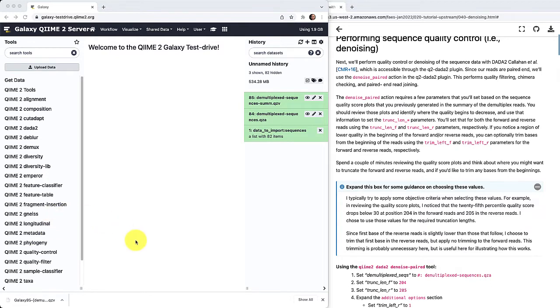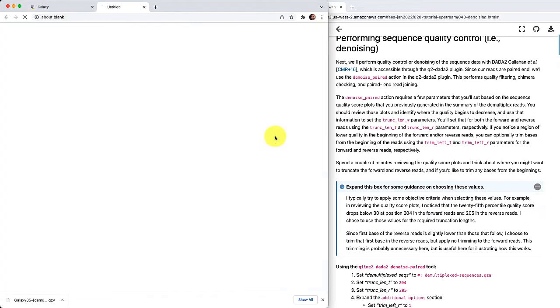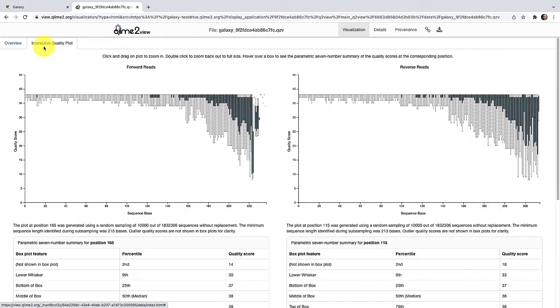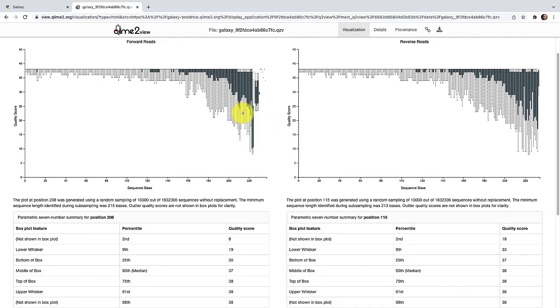Let's begin by examining the interactive quality plot found in the previously generated visualization. To open it, we'll come to the History in Galaxy, click on the label, come down to View at QIIME2 View, and click on this to open our visualization in a new tab. Once our visualization is open, we'll come up to the top and click on Interactive Quality Plot. Now we can see both our forward and reverse interactive quality plots. I'm going to scroll down a little bit so that we can see both the quality plots and the parametric seven-number summaries.